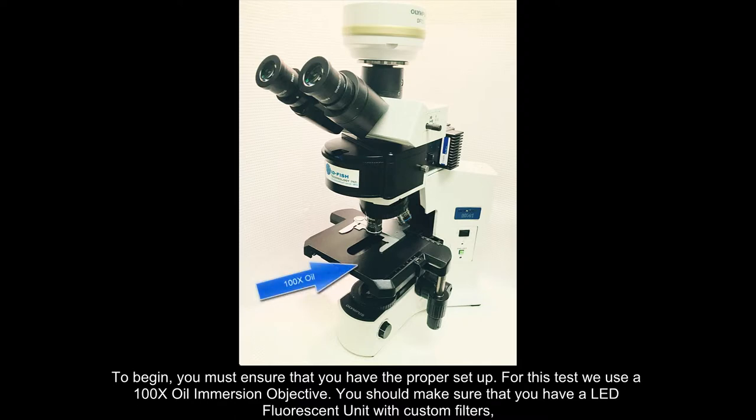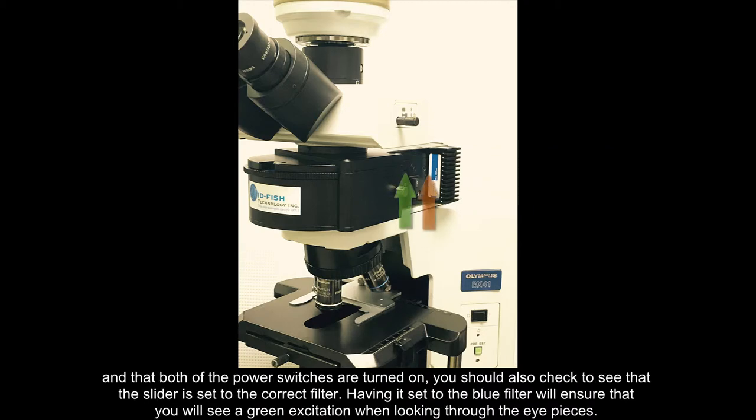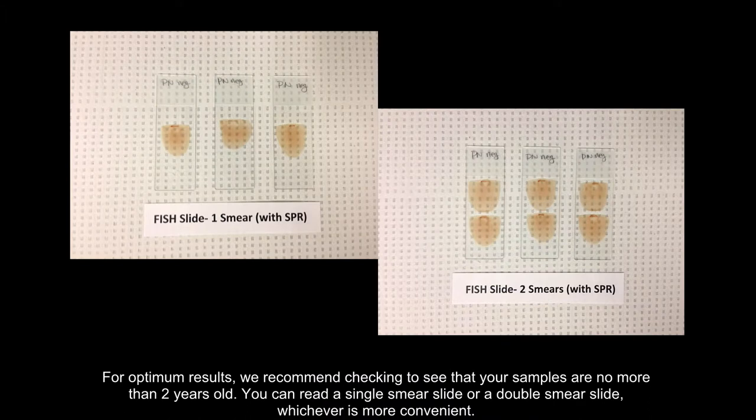To begin, you must ensure that you have the proper setup for this test. We use a 100x oil immersion objective. You should make sure that you have an LED fluorescent unit with custom filters and that both of the power switches are turned on. You should also check to see that the slider is set to the correct filter — having it set to the blue filter will ensure that you will see a green excitation when looking through the eyepieces.